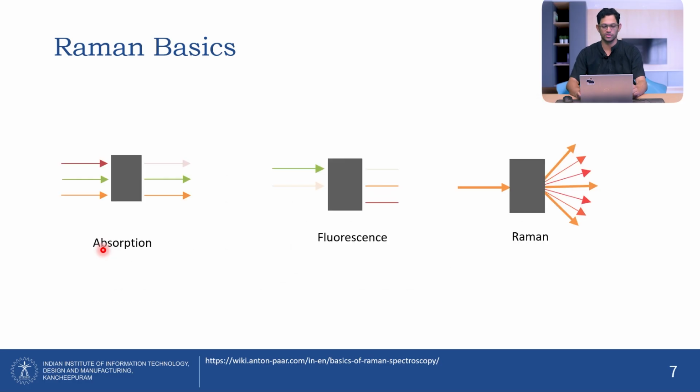And then you have the light intensity, of course, that is how much of the light is being shone on a particular surface. Okay, so we talked about absorption, meaning if you have a compound light source with 3 components, red, green, and orange in this case, just a representation, then after the interaction with the cuvette, the red component of light is absorbed, green is a little bit less absorbed, and orange is actually passing through.